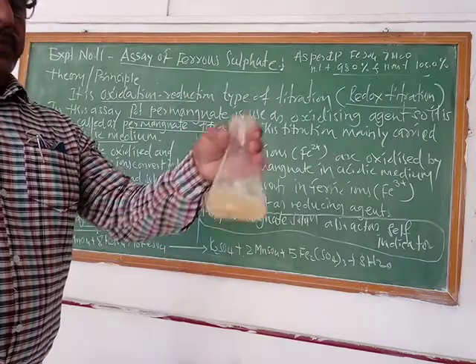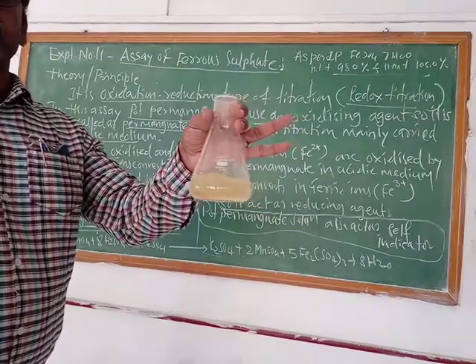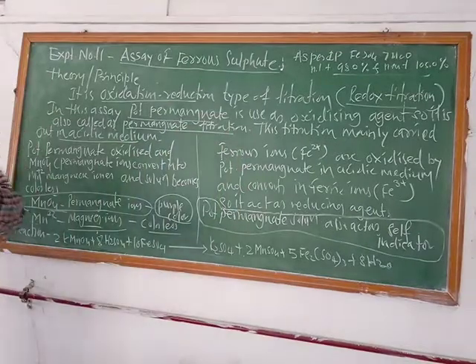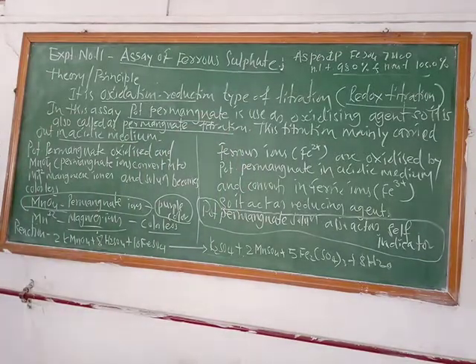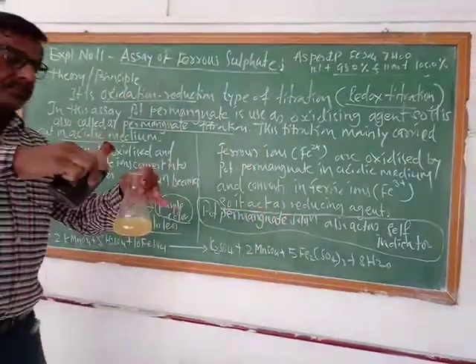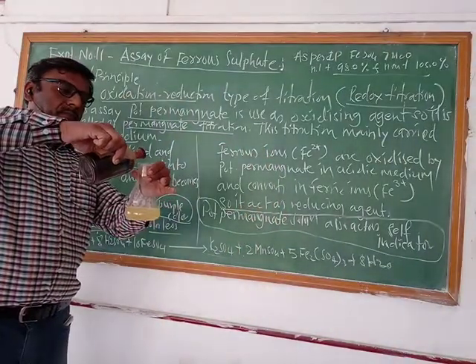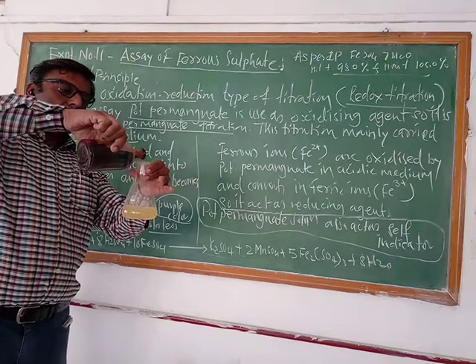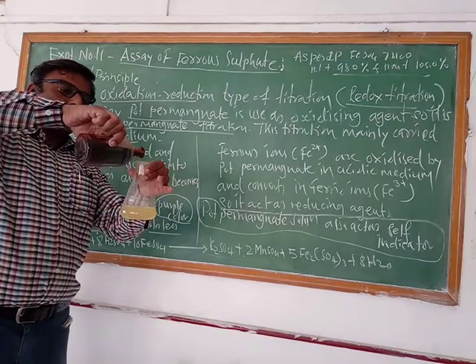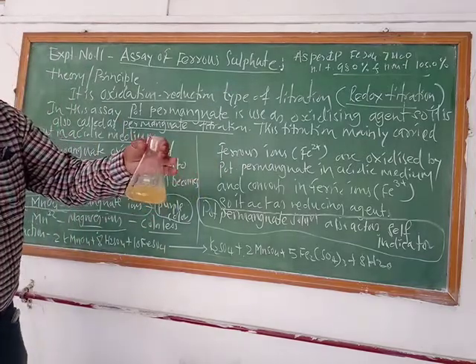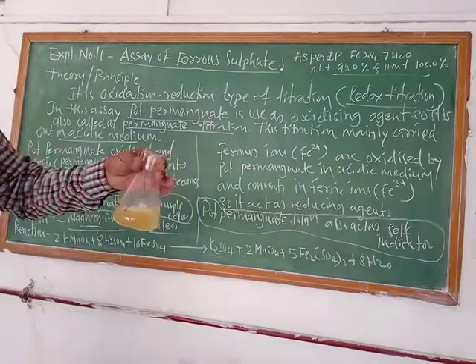In acidic medium, it becomes colorless. Simply, if you add potassium permanganate, it will become colorless, as we see here. It becomes colorless.